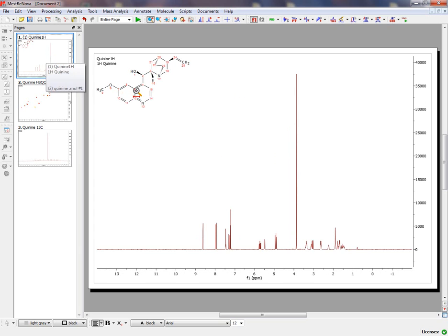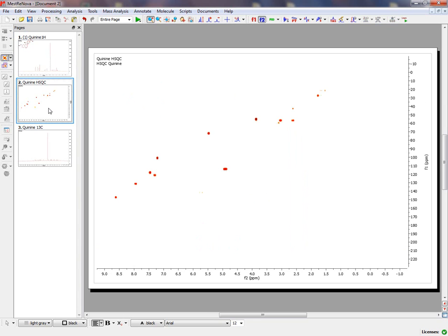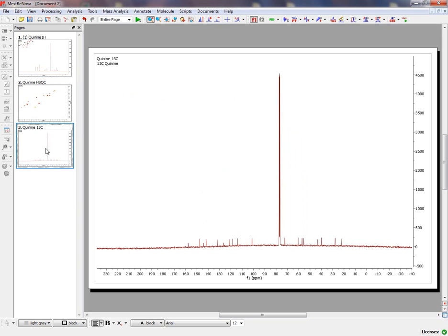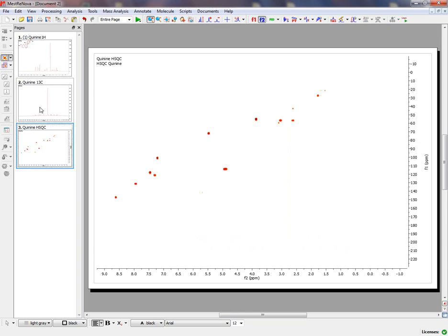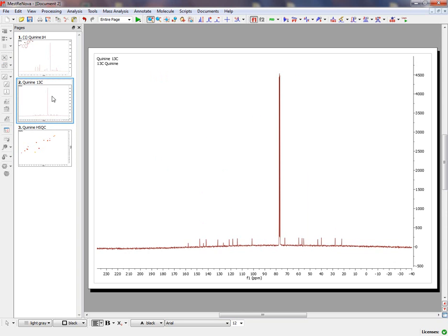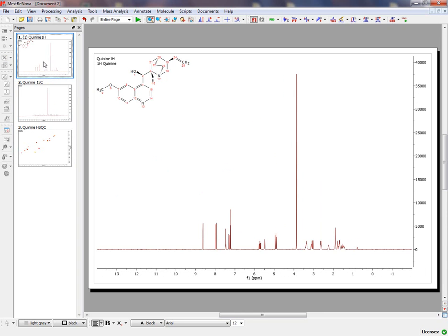As you can see here, we have the Proton NMR fully processed with the MOL file, the HSQC, and the Carbon NMR Spectrum. The graphical user interface is like PowerPoint, so we have a page navigator and we can move from one page to another.